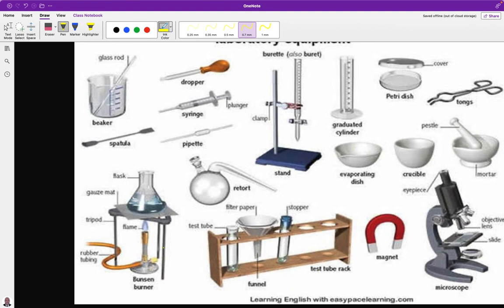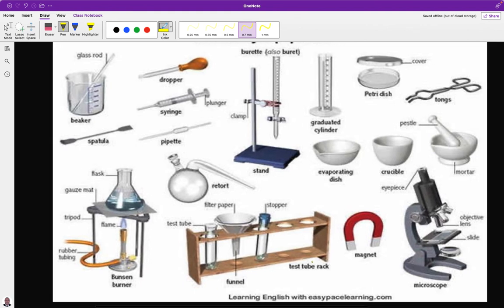We have a test tube rack, where we can stand test tubes — open, with stoppers — and even funnels. We have an evaporating dish, another equipment used to heat a solution. For example, a solution containing salt and water: we heat it in the evaporating dish to evaporate the water so that we have our crystals of salt.